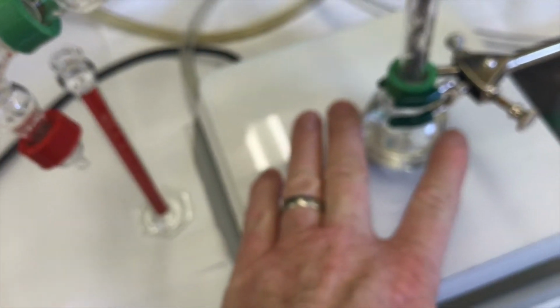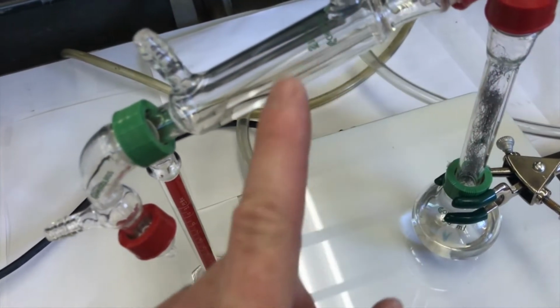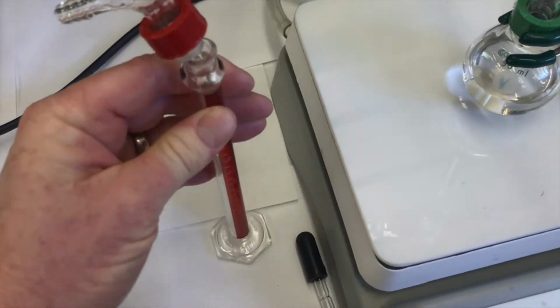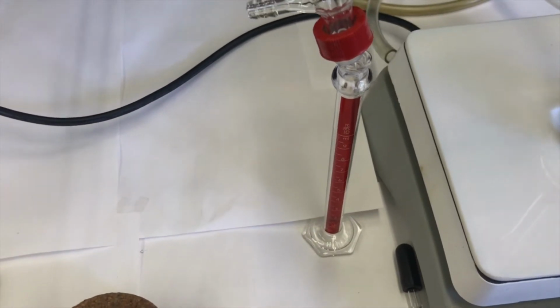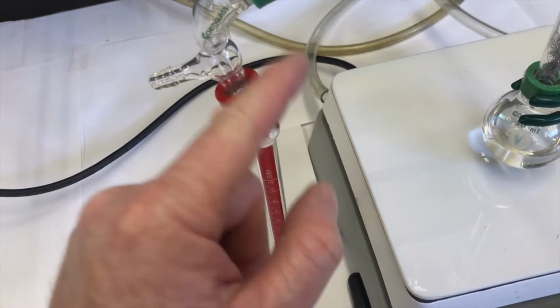I'll tighten that. But the way it's going to work for us is our liquid down here is going to boil, and the gaseous vapors will come up, get separated, and then when they hit this area, this will be cooled by water. They'll condense from gas back to liquid, and they'll drip out into our 10 milliliter graduated cylinder, and we'll keep track of the volume. And our system is open. It's not closed because gas can come in here and there.